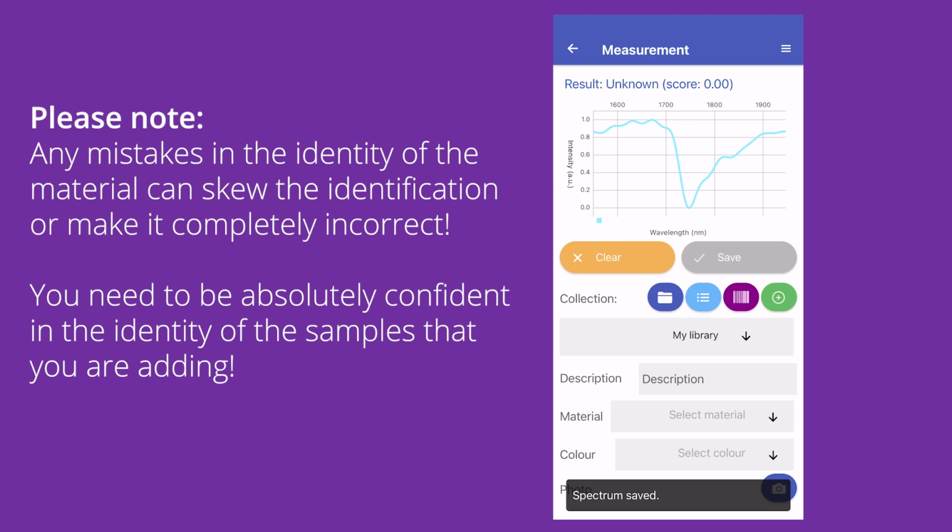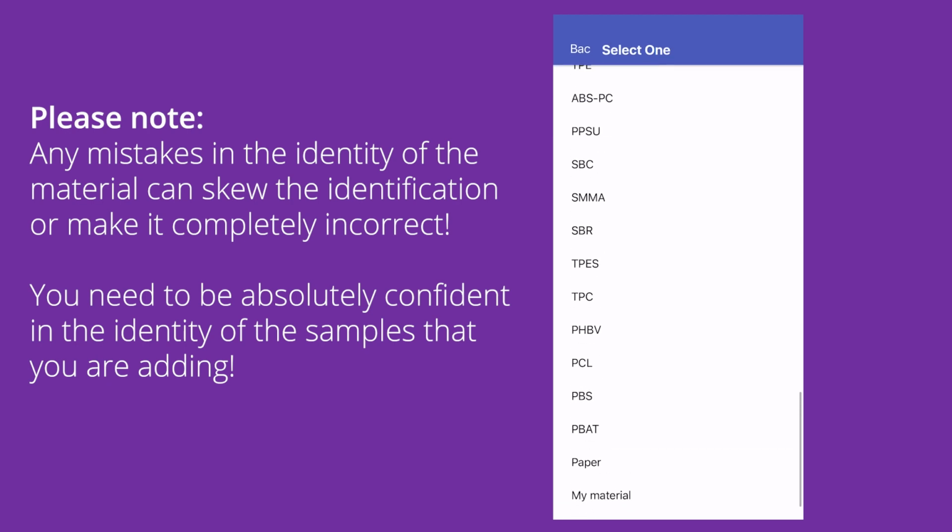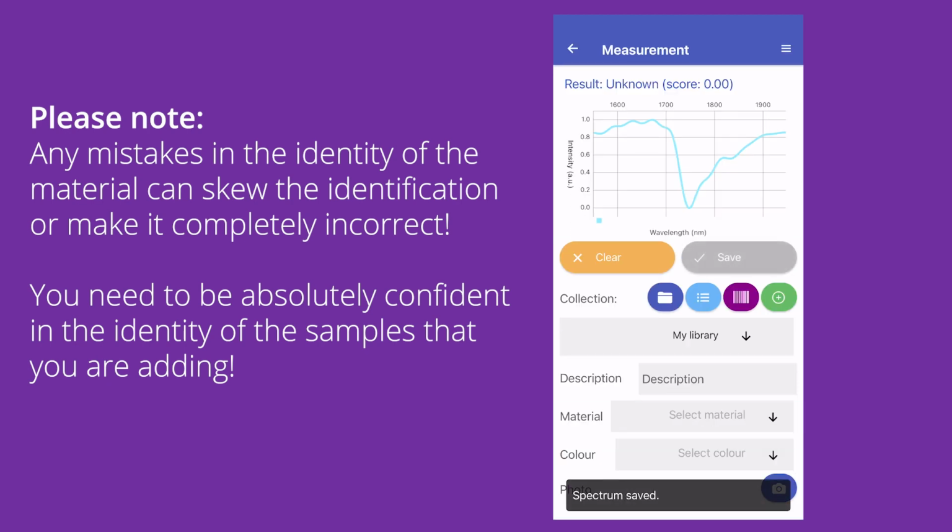It is important to note that any mistakes in the identity of the material can skew the identification or make it completely incorrect. You need to be absolutely confident in the identity of the samples that you are adding.